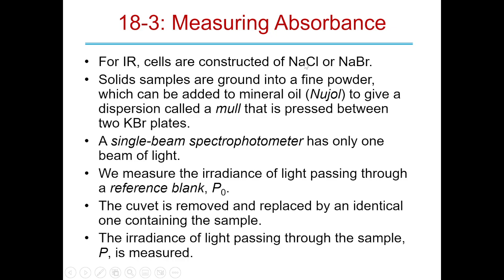They get worse over time. You have to smooth them. It's called polishing them. And what you do is you put absolute ethanol with a chromium oxide agent, a chromium 3+, not the 6+, okay? Because that's highly toxic. It's that green powder that they put in vitamins.